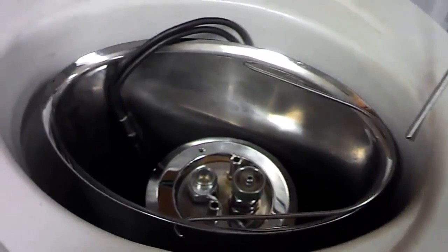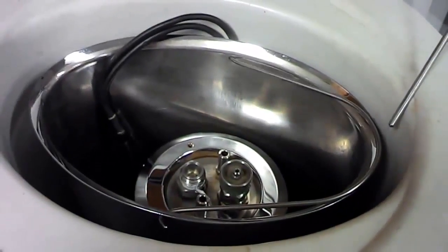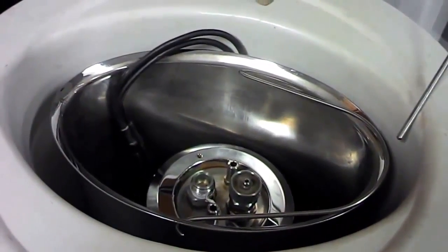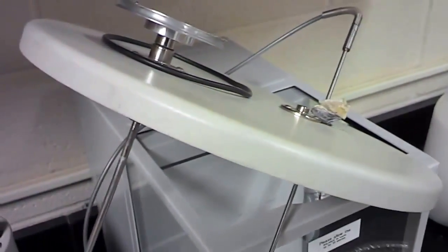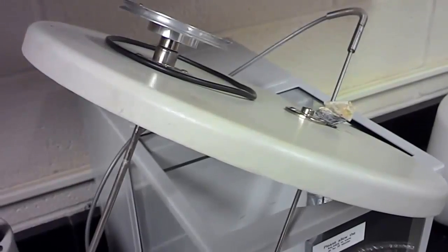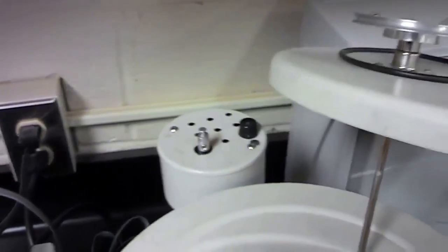So how is the energy collected, or how does a scientist figure out how much energy is being given off? Well, it's a closed system. There's a lid here that goes on top of this calorimeter. And what's in here in the lid is a stirrer.